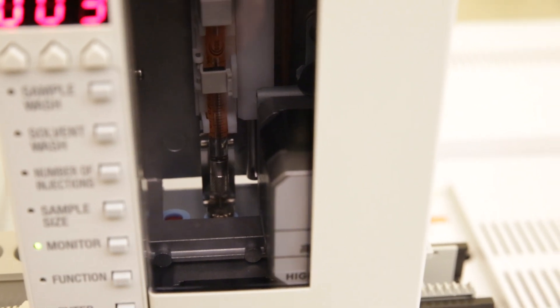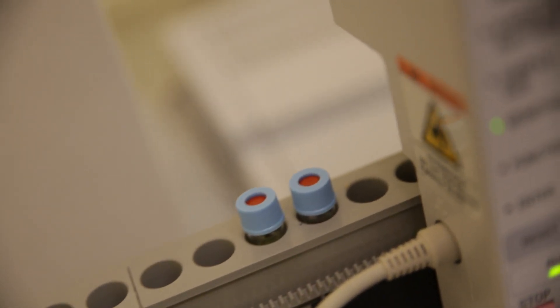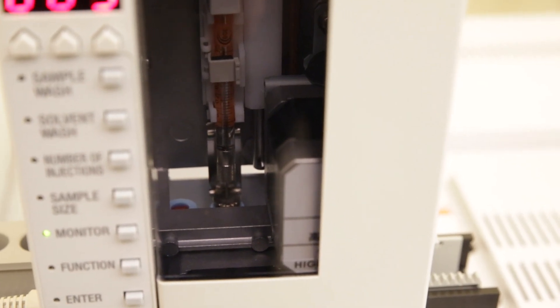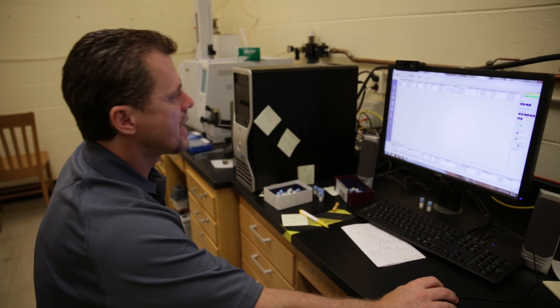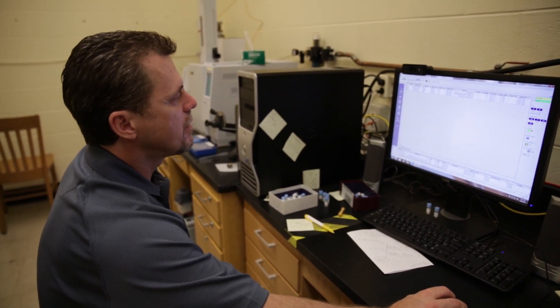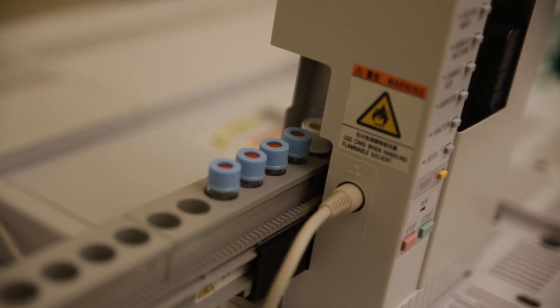What we have here is one of the latest GCMS models from Shimadzu. It's a Japanese company that's come along recently as one of the preferred equipment makers for this type of analysis. You put in the sample name, the type, the method you're going to use, and once you have all this information in the computer, you load the samples into this auto-sampler.